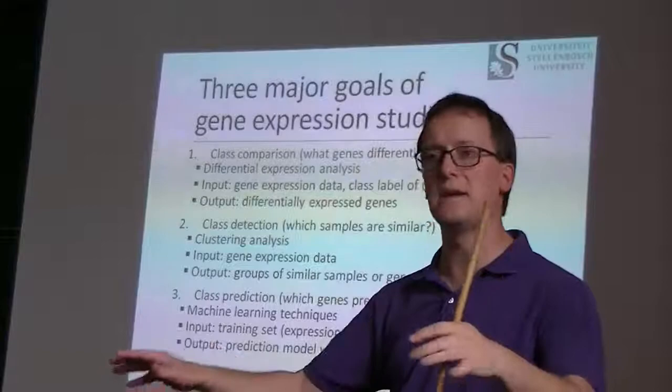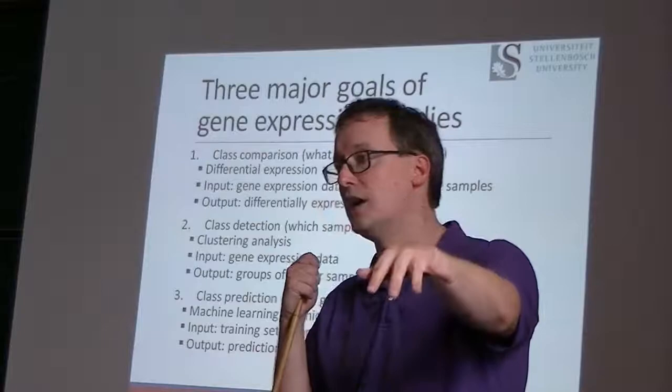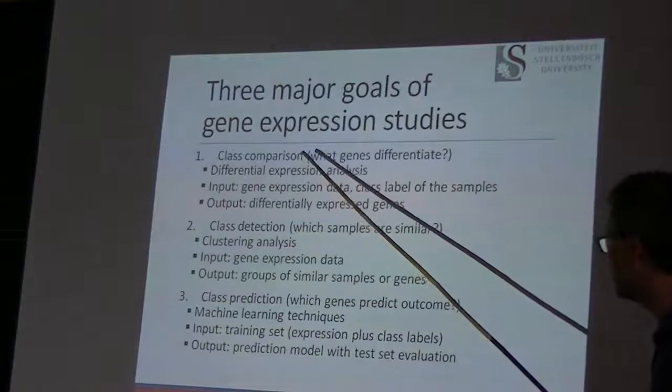So one of the things we might ask is, how does gene expression tally with our foreknowledge of the fact that these types of cancers are different from each other? I've got a class A cancer, a class B cancer, a class C cancer. I want to see if gene expression is something that helps us to understand the differences among them. So that's class comparison. We typically use differential expression analysis, which we're going to go into.